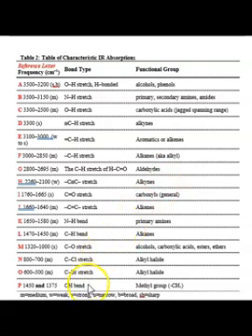But down here you have this interesting thing. It actually has two, and we don't see that much on absorption tables, but there's two peaks at 1450 and 1375. Now, they don't have to be exactly at those positions. They can be close. Other things might factor in, but generally in these areas, the CH bend, and that could be this methyl group, like it says CH, but really you're going to see it more often as a methyl group, so that there's this bending that's going on, and it must absorb at these two frequencies. That's pretty much all that says.